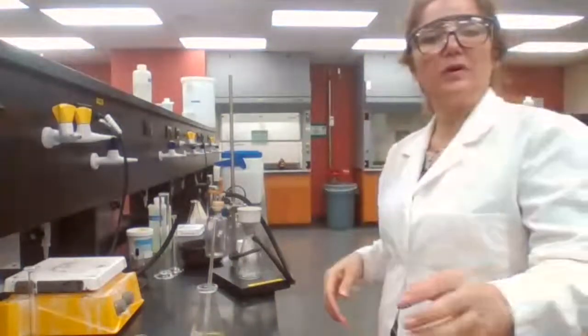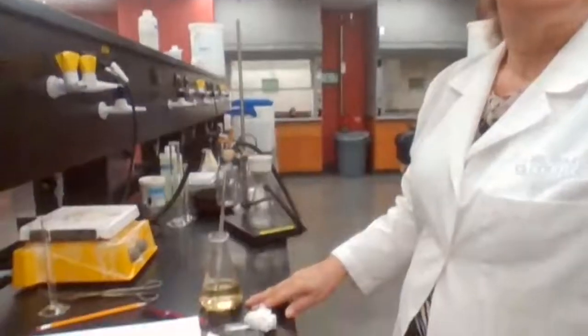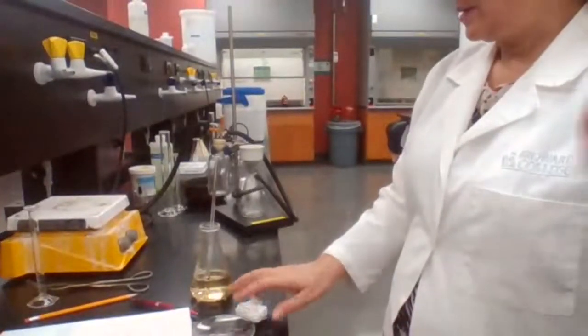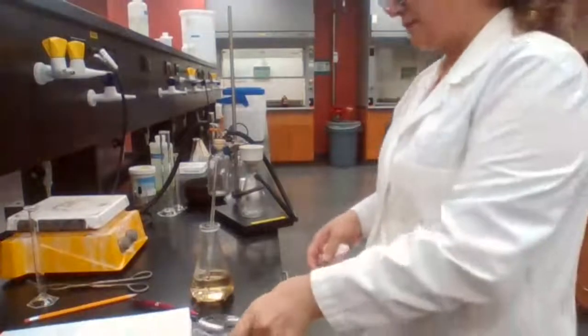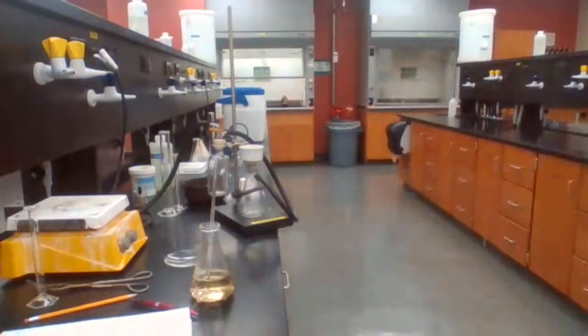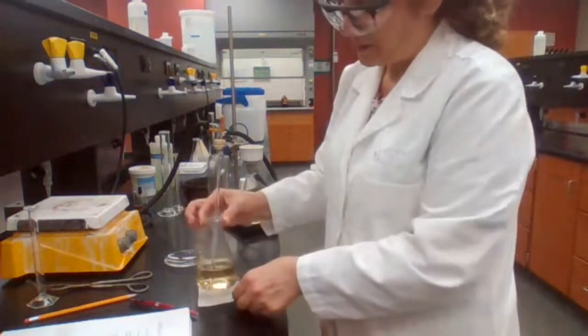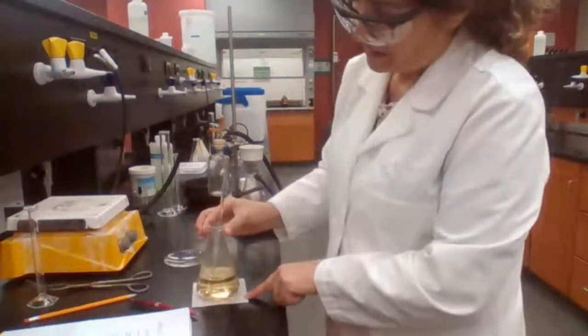When the crystals form, then we can place it in the ice bath. Let's see if I can put white paper, maybe it's easier to see for you underneath.